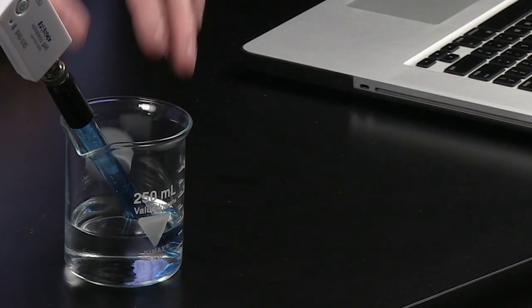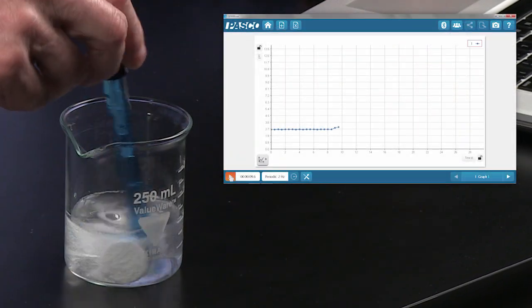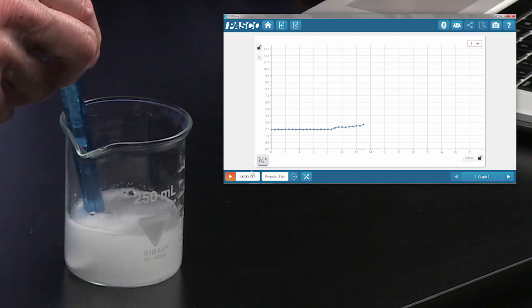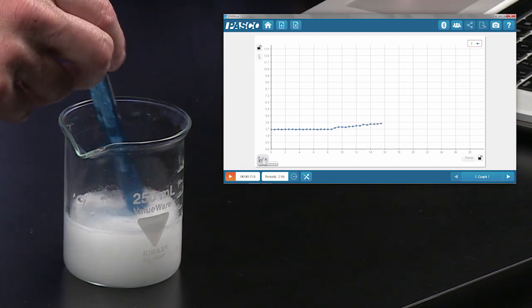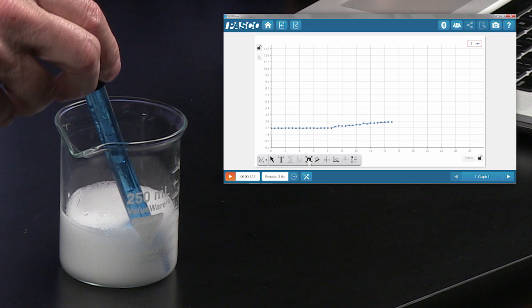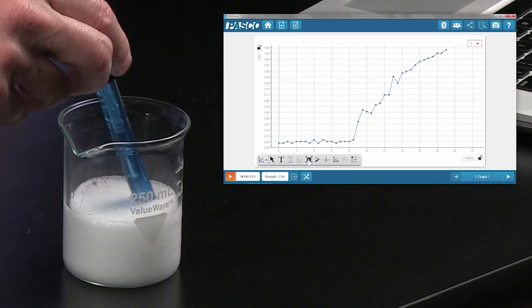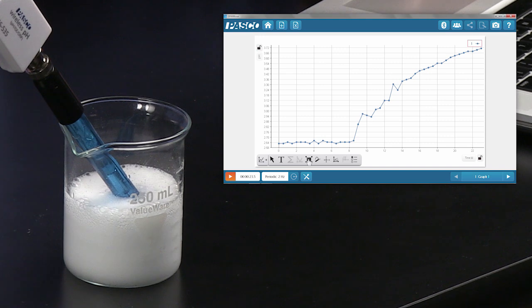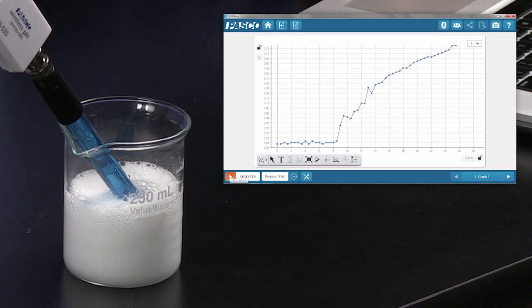We'll see that change by adding a base. I've got a little Alka-Seltzer here, which is going to buffer that solution. I'm going to stir it just a little bit to make sure I've got a nice even mixing of those chemicals. I'll auto-scale it so we can see the magnitude of the change. That pH is definitely climbing as the base was added, and it should plateau after a while.